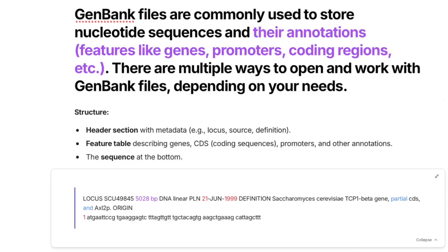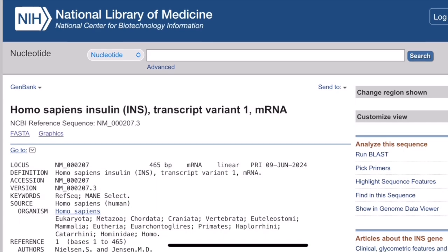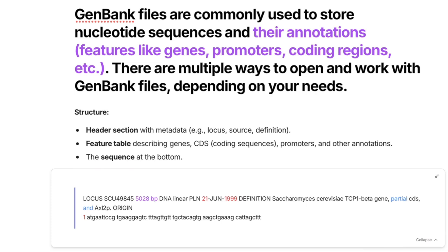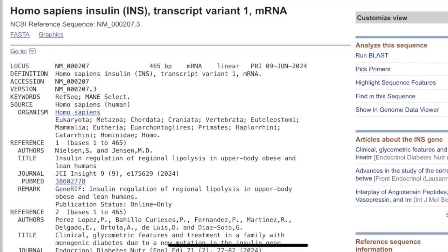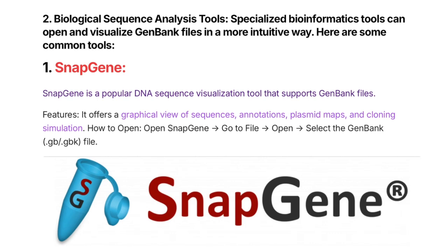You can open a GenBank file in a text editor, but it's not going to be the most user-friendly way. If you open it with a text editor you'll have to manually pick out those annotated features. Similarly, FASTA opened in a text editor won't give you the specialized annotations. That's why there are dedicated software tools — so let me introduce you to SnapGene.